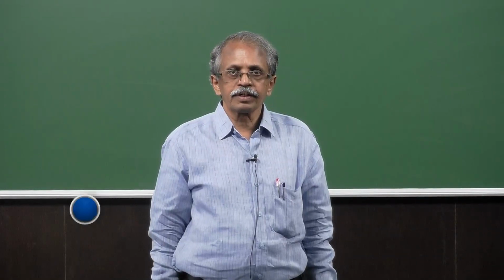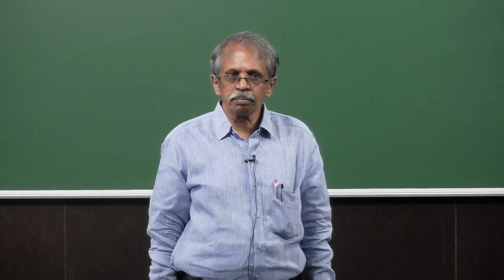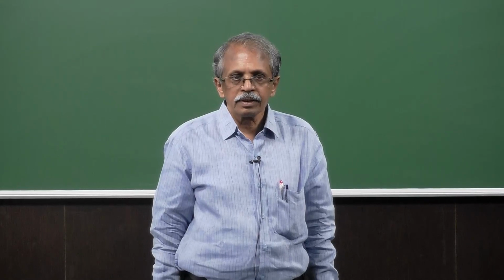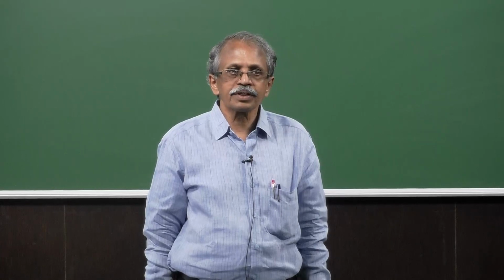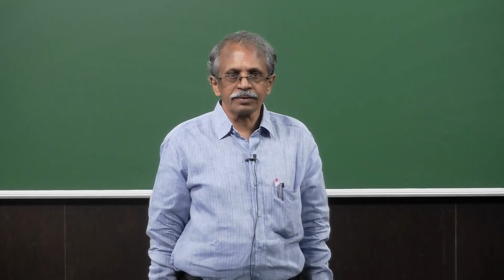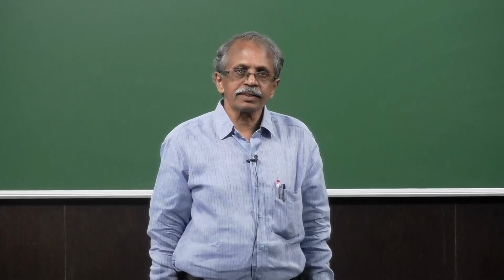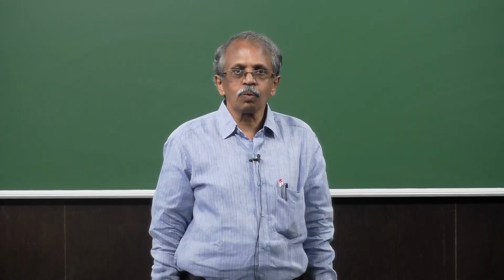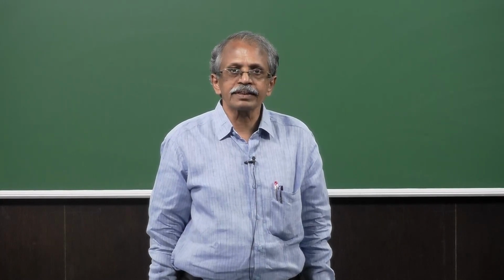Good morning. Welcome, you all, to this next lecture in this course on analytical, spectral and microscopy applications of inorganic compounds and nanomaterials. We have seen a plethora of spectroscopy techniques till now, maybe more than a dozen spectroscopy techniques. Of course, some analytical techniques as well. Let us look into one of the important extensions of the spectroscopy, but it is a diffraction technique.